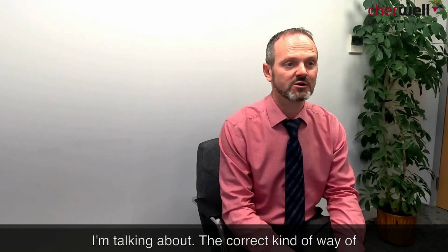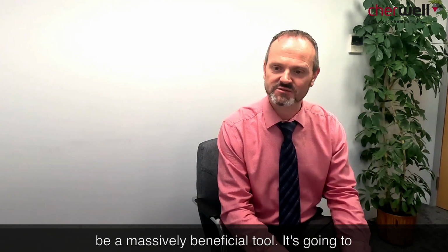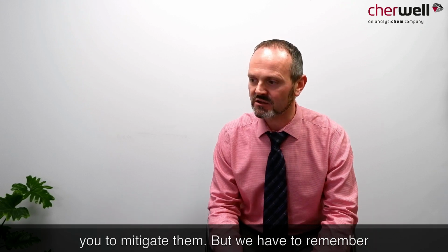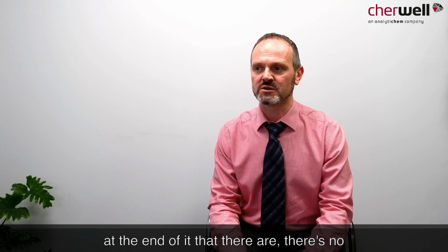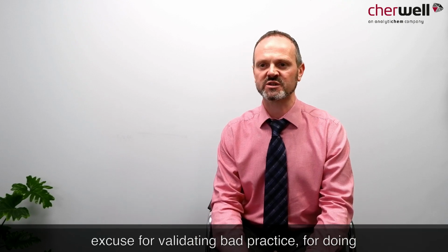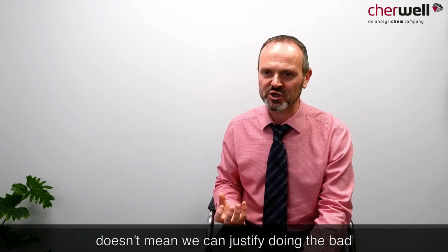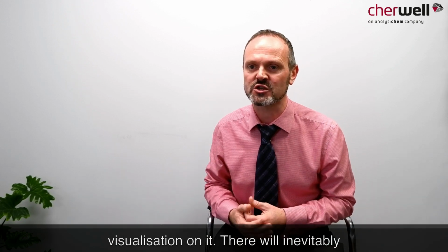The correct way of doing airflow visualization studies can be a massively beneficial tool. It's going to help you to understand your risks, help you to mitigate them, but we have to remember at the end of it that they're no excuse for validating bad practice, for doing something in a bad way. They're going to show you the good as well as the bad, but that doesn't mean we can justify doing the bad because we've taken a video, we've done smoke visualization on it.